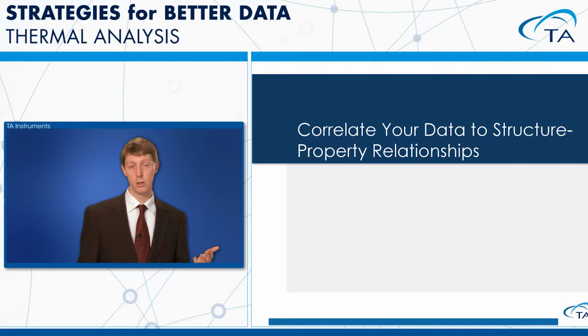Now, those were all just tips on presenting your data. Once you've collected it and you want to actually associate those particular transitions with something, that's really where the key to analysis comes in. So in this next section, we're going to look at correlating the data that you've collected and presented and analyzed, and compare it to correlate it to a particular structural property.